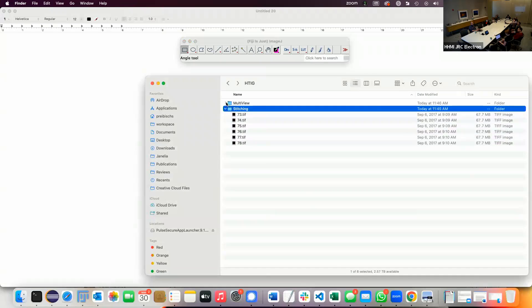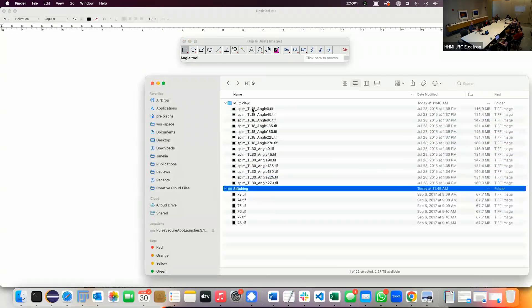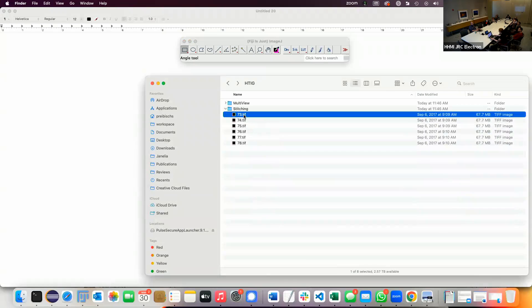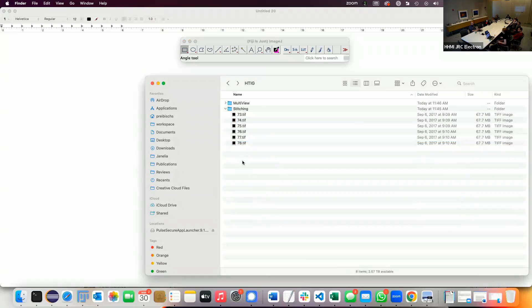Today I made two folders for playing around. One is a multi-view dataset — if you have time later we will look at this. And here is just a very simple example of a stitching problem.